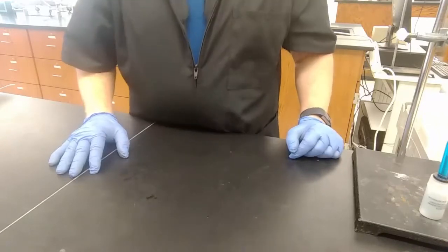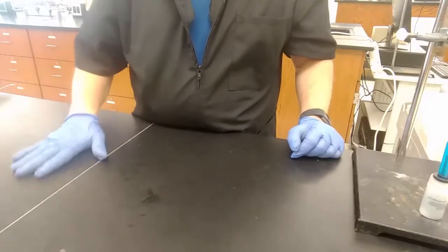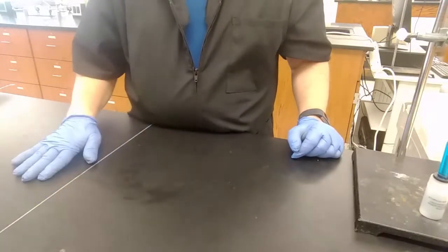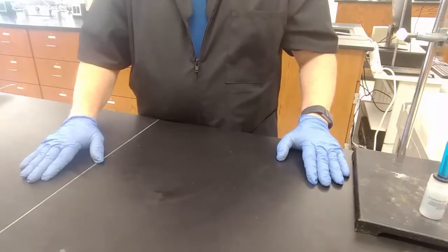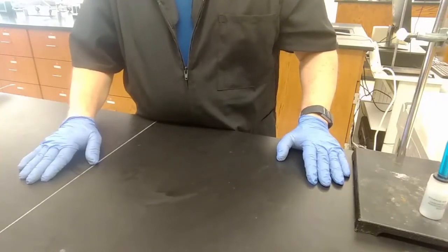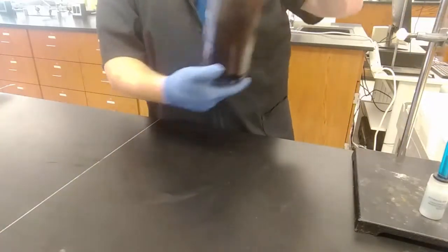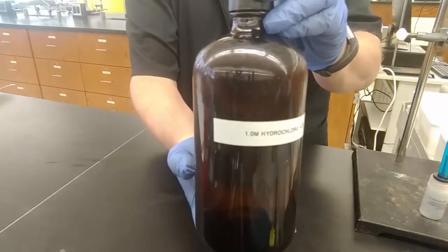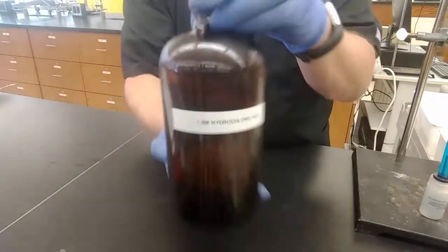So again, in the pre-lab material, we went over what a dilution equation is, that molarity times volume equals molarity times volume, because the number of moles is constant. So we'll follow along our steps in order. We're going to take 100 milliliters of 1 molar acid solution. So here I have, supposedly, as long as it hasn't evaporated, 1 molar exactly hydrochloric acid solution.